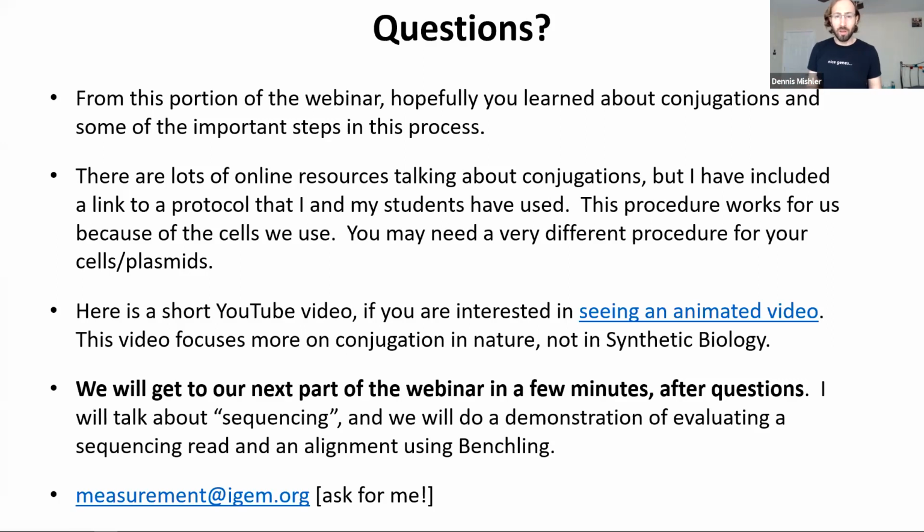And you're like, it doesn't work. So you can now either spend a lot of time creating a completely new transformation procedure, trying to figure out what will work for your bacteria, which can be very involved and take a long time. Or you can say, I'm just going to use the conjugation machinery that normally works in most bacteria, and you can try that route. A lot of people will go that conjugation route to get things to work, because they'd rather have engineered bacteria to work with than spend a long time figuring out how to engineer them. I think that's a really big thing.